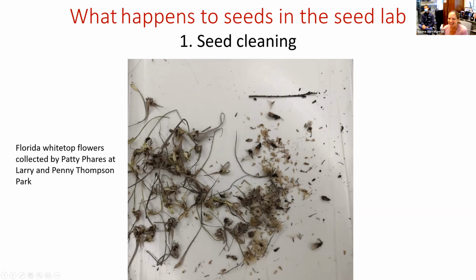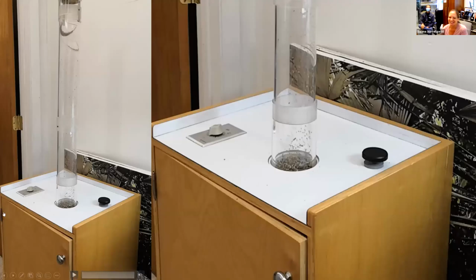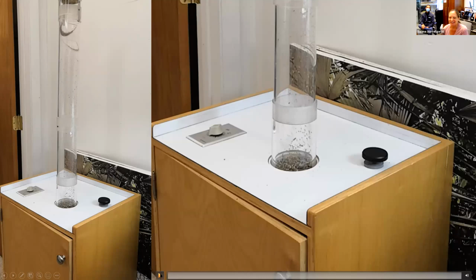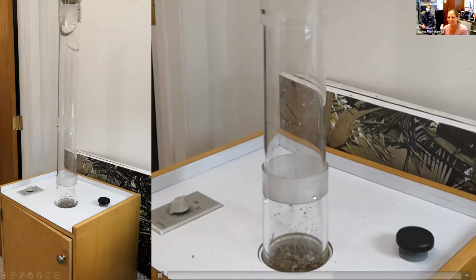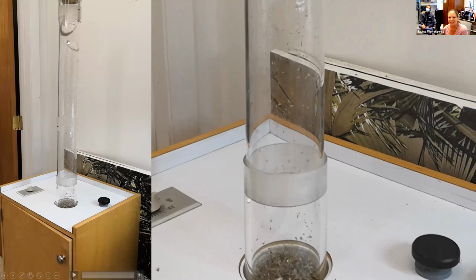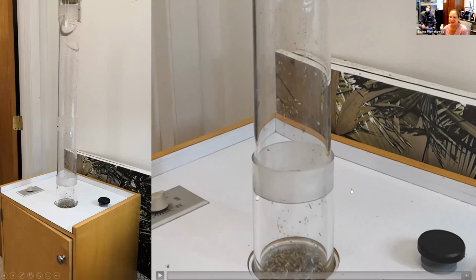These seeds are really tiny black seeds, so cleaning them from all this chaff by hand would be really time consuming. That's where my most favorite tool in the seed lab comes into play, which is the seed blower that you can see here. It's a machine that is basically a pump that pumps air from the bottom to the top. You put the seeds and the chaff on the bottom, and when you start it, you can control the airflow. Normally the chaff is lighter than the seeds, so the chaff starts flying up and gets caught here in these little barriers, whereas the seeds stay on the bottom. Sometimes you have to repeat it a few times, but at the end you get clean seeds without spending hours doing that by hand.